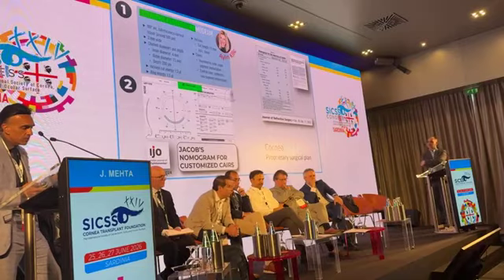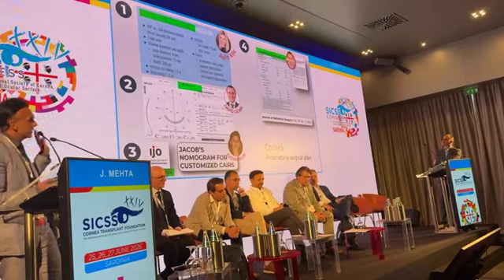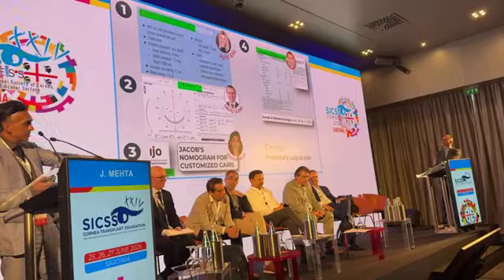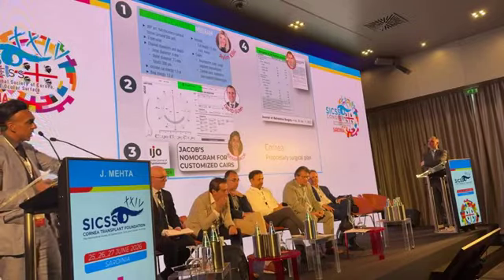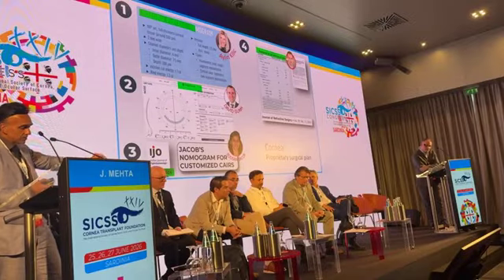Okay, a little bit on nomograms, so this will be quite quick. Obviously, there are different nomograms depending on what tissue thicknesses you saw. As you saw in Brandon's video, that tissue was super thick, okay? So the width of your tunnel is going to be wider. Because I'm using e-beam, I use the same nomogram that Shadi uses in his publication. David Gunn in Australia has a very nice nomogram where you plug in all the data and it will tell you what kind of segment symmetry you're going to use.